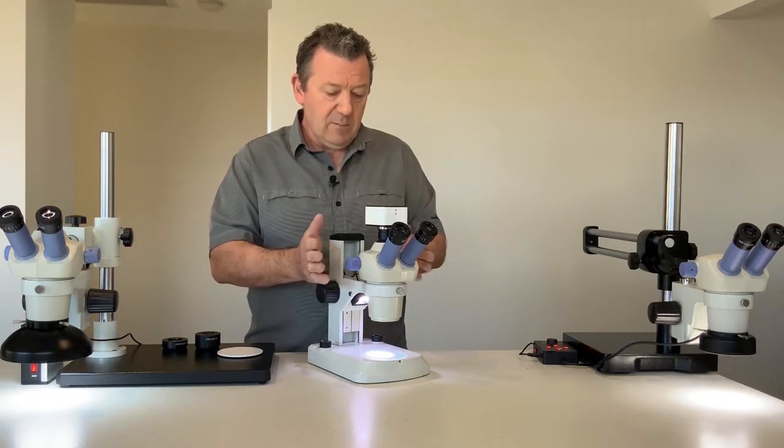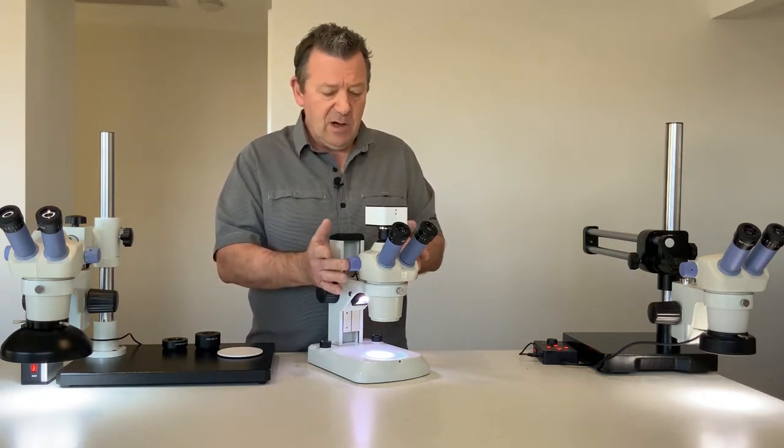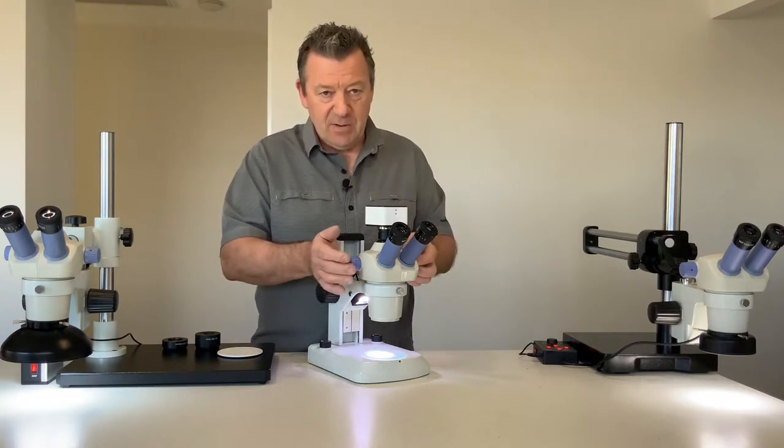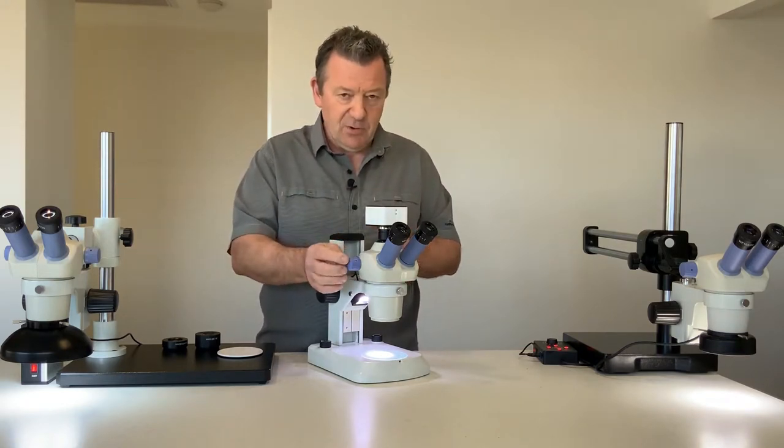People often buy them for a classroom situation where you've got a lot of people and you want to demonstrate your specimen, so you connect your USB powered camera to your computer.